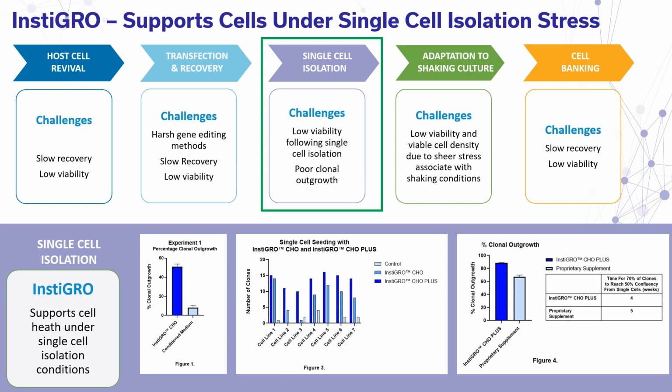Scientists will still be faced with having to seed a high number of plates to achieve the required number of clones needed for screening. This increases the time spent on the process, the consumables, and increases the amount of labour required for processing more plates.